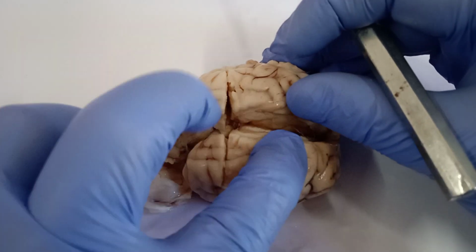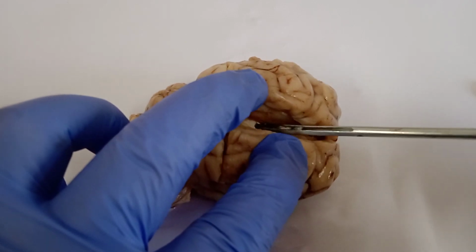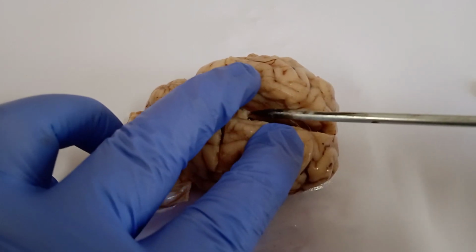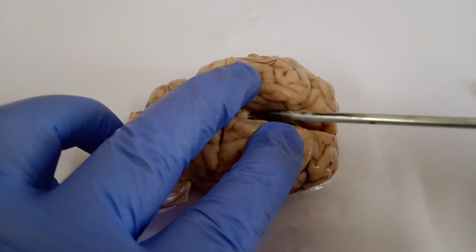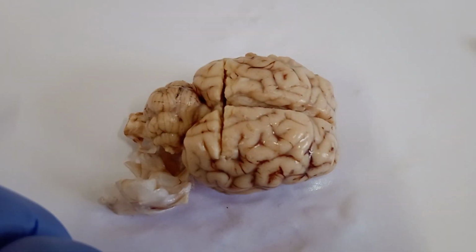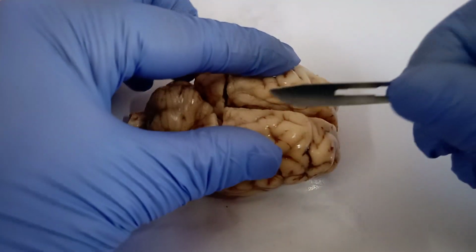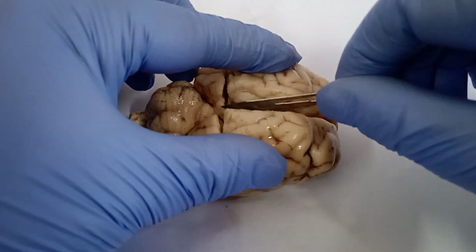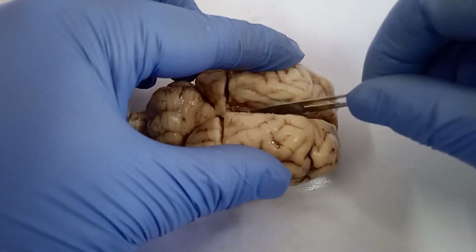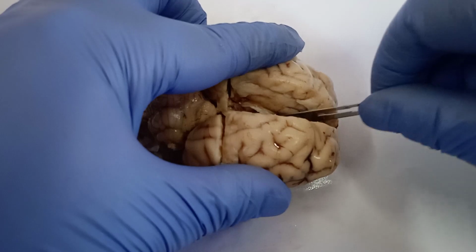So if you look at how deep it is, the cut that I have made here is basically through the corpus callosum. This is a commissural fiber, the commissural fibers connecting these two parts of the cerebral hemispheres. So let us give a cut through this longitudinal groove. Here I am making a cut, and I am basically cutting the corpus callosum.